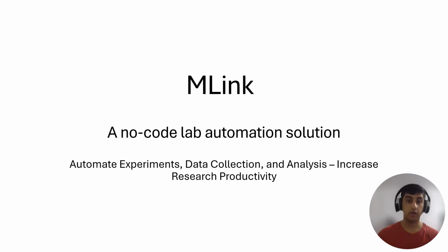Hey everybody, I'm Agosh, and I've been working on MLink. It is a no-code lab automation solution.